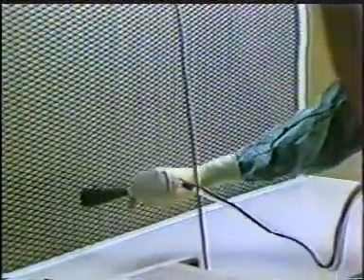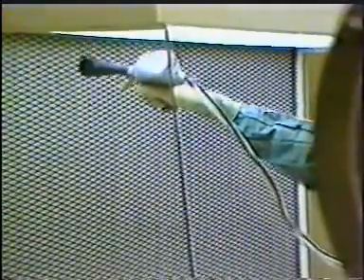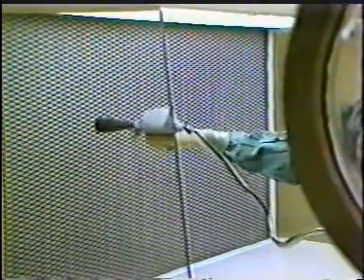Similar determinations are carried out on laminar airflow cabinets. In these cases, it is necessary to pay particular attention to the seals around the filter, where considerable leakages can occur. Testing is carried out both at regular intervals and when filters are replaced.